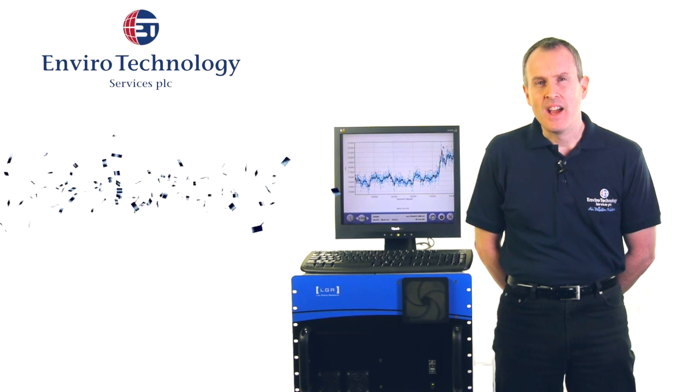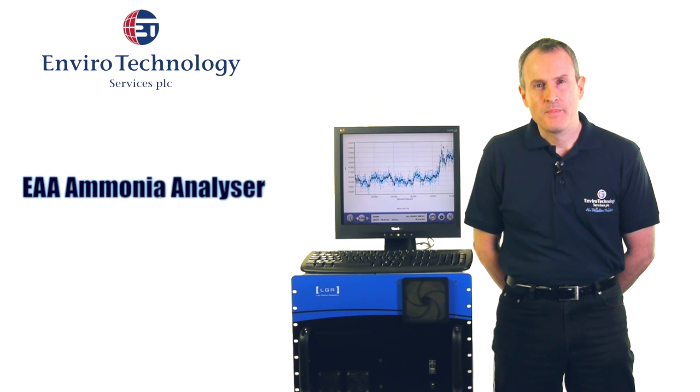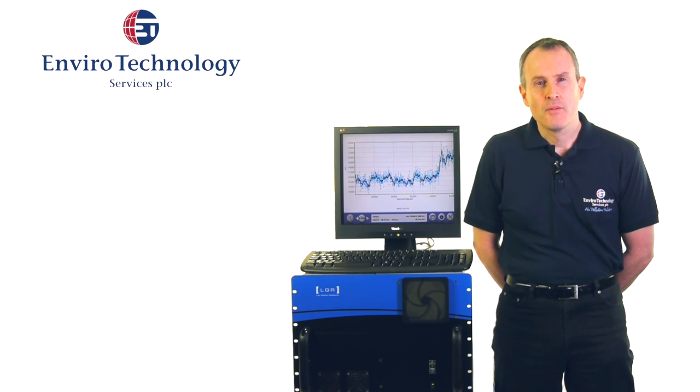This is the EAA Ammonia Analyser from Los Gatos Research. It's one of a very wide range of analysers from Los Gatos.